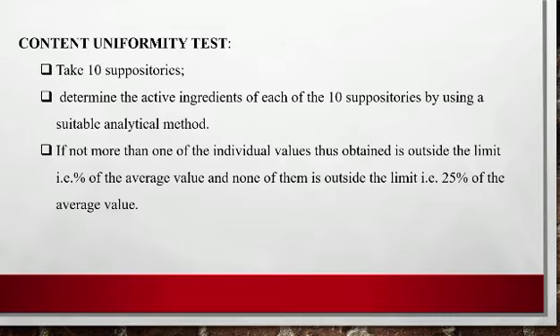Next is the content uniformity test. For the content uniformity test, we have to take 10 suppositories and determine the active ingredient of each suppository using a suitable analytical method. None of the individual values should be outside the limit of 25% of the average value.